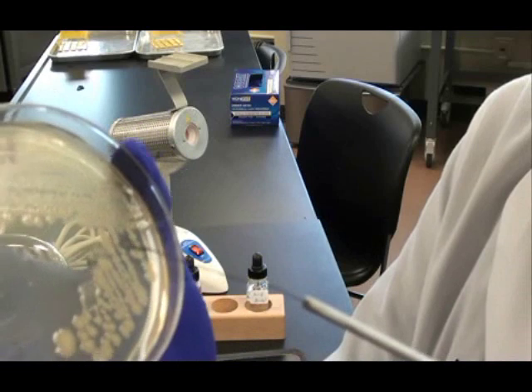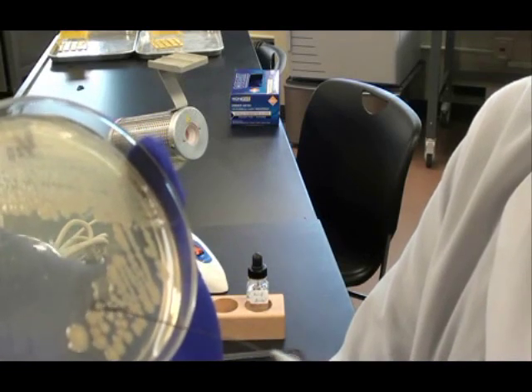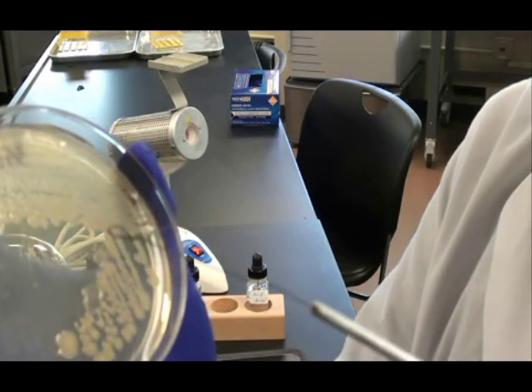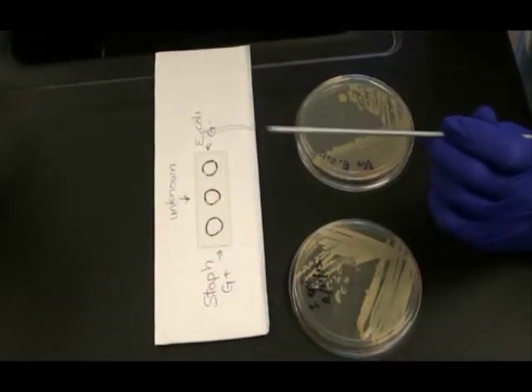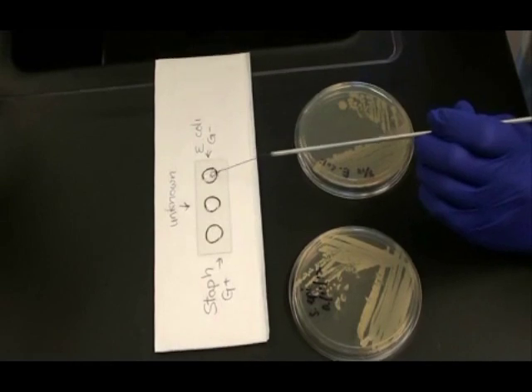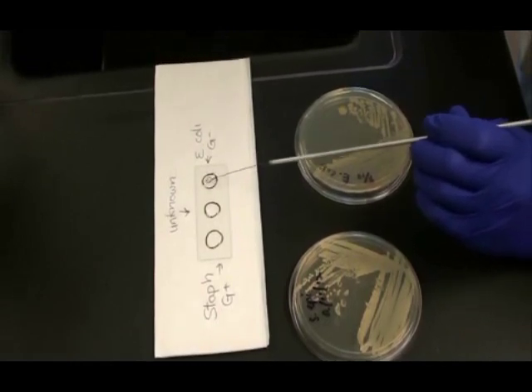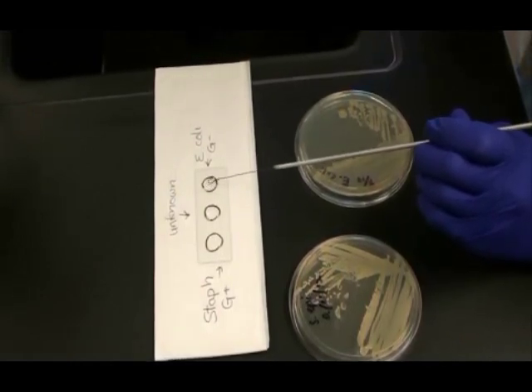So to obtain a sample, I just take my cooled loop and run it across a colony that's growing on the surface of the medium. Then I swirl that sample into the water droplet in the circle on the right side of my slide.